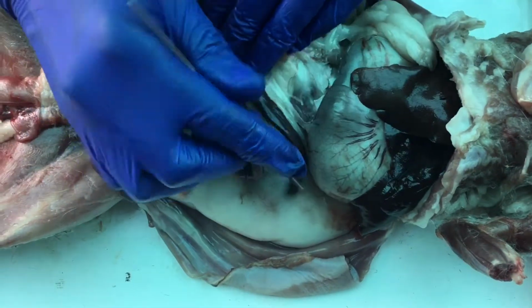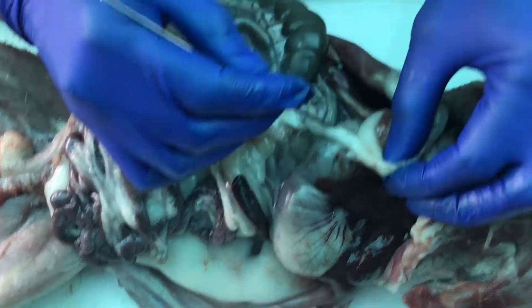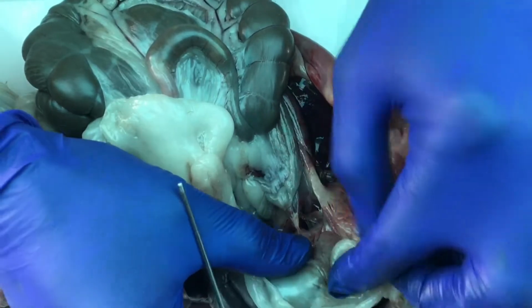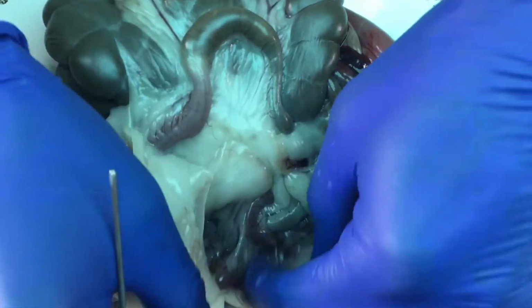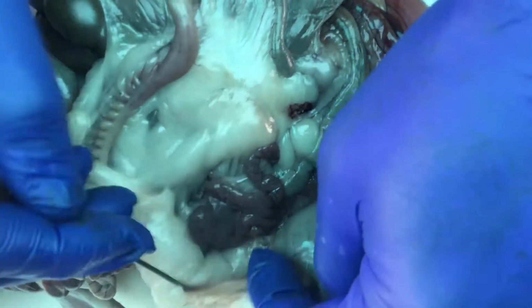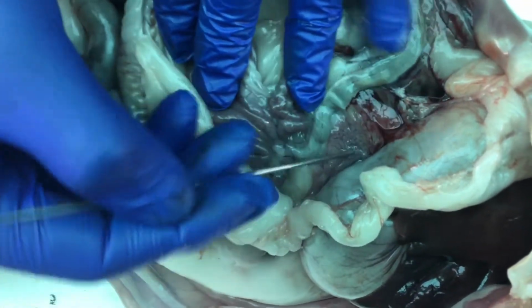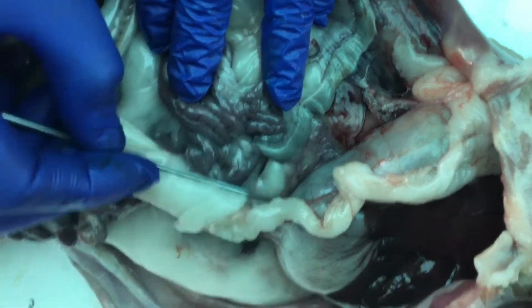If we go back, we saw our spleen here along the greater curvature of the stomach, and if you come back and we look at where the stomach meets the small intestines at the duodenum, we have a very diffuse pancreas in the mesentery. There's not a whole lot of it that you can see, but you can see kind of angling back towards the spleen, this diffuse gray glandular tissue in the mesentery. That's the pancreas in there.